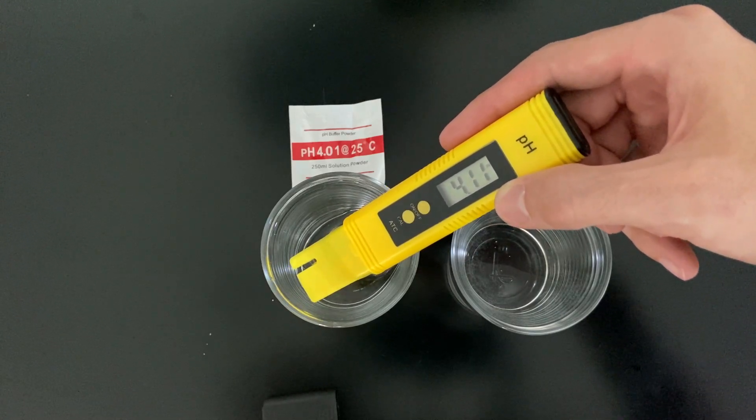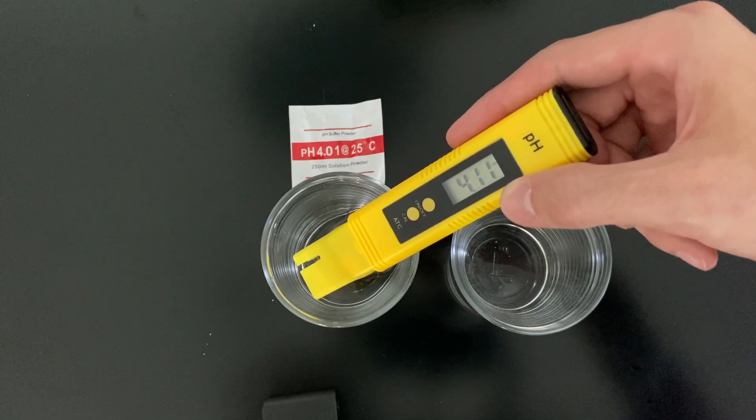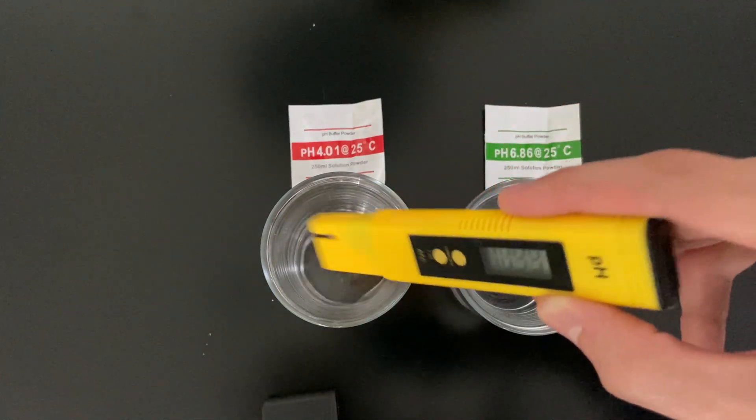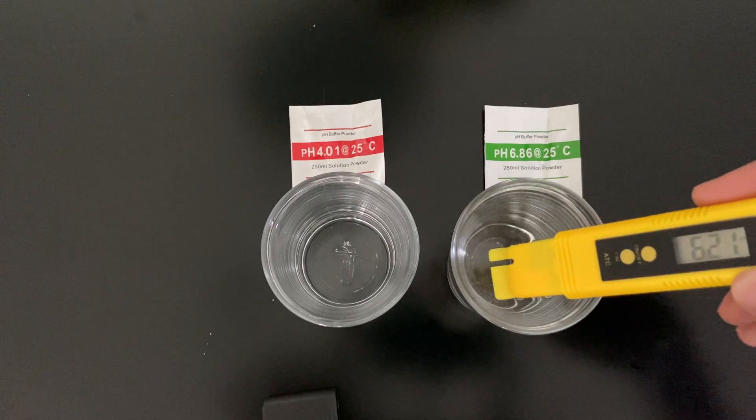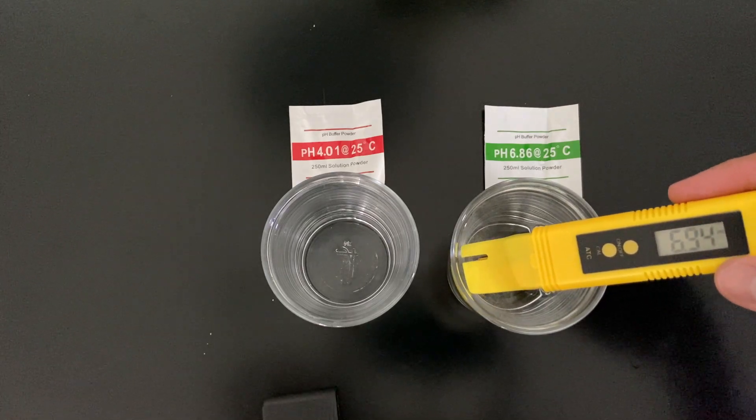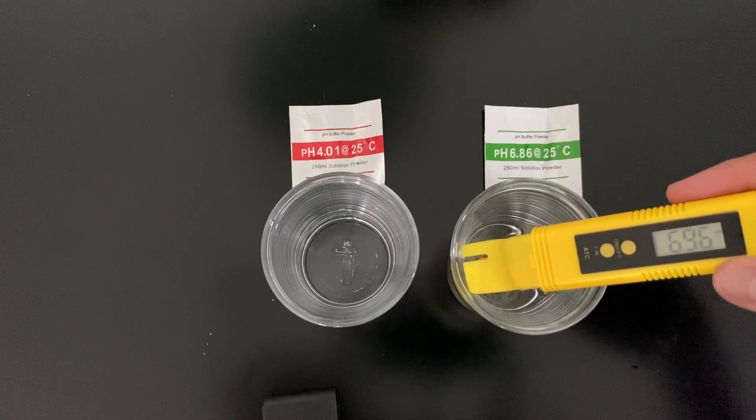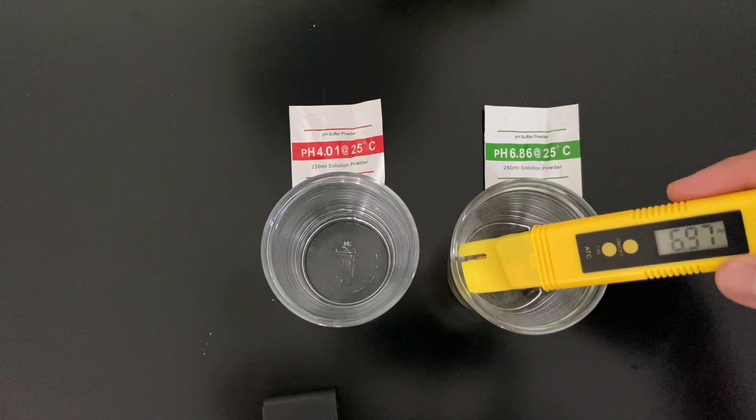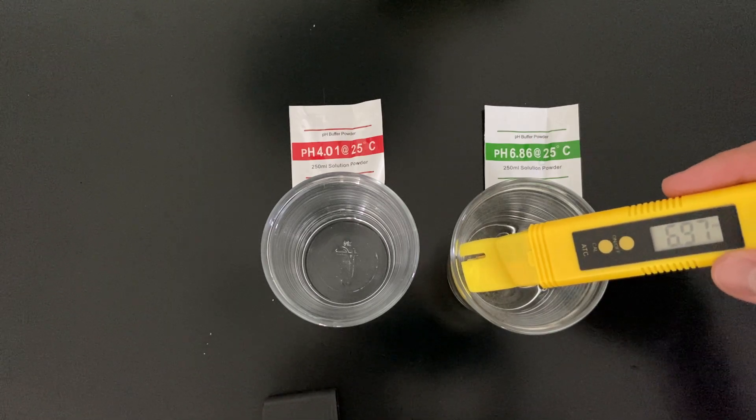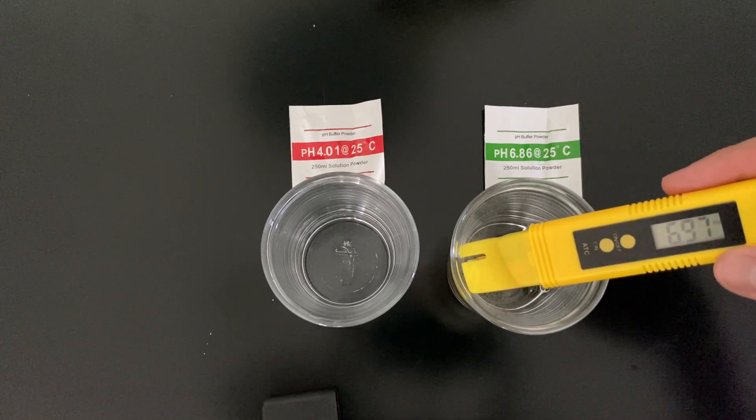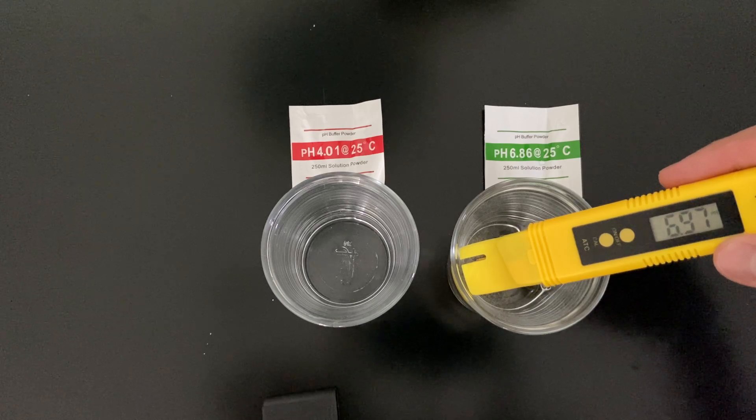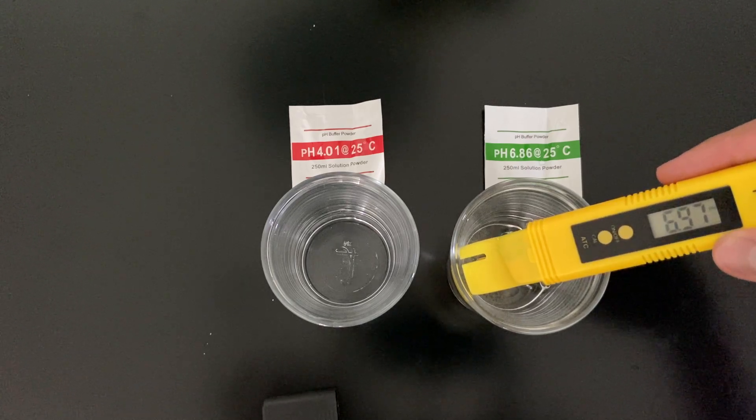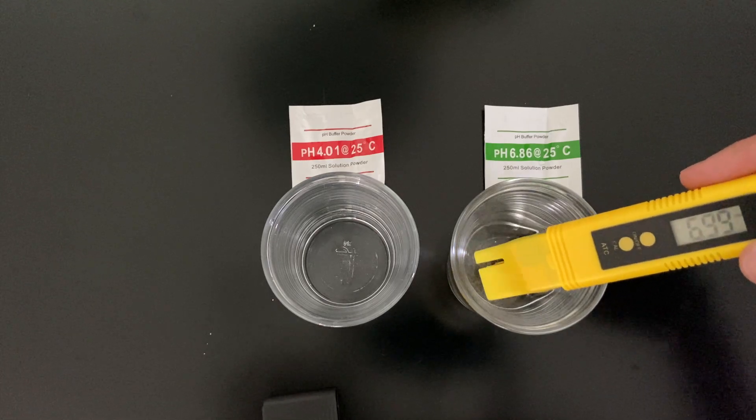Now let's test the other solution here that should show us something around 6.86. It's now showing 6.97, so very close to the original value.